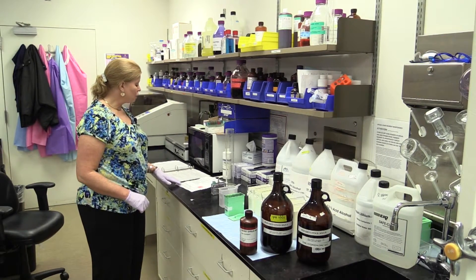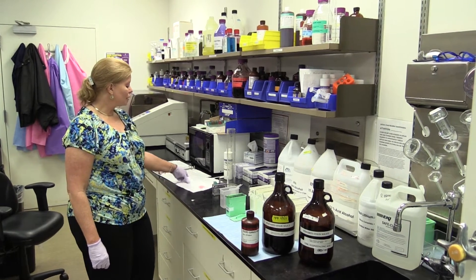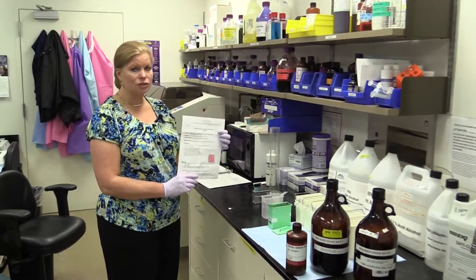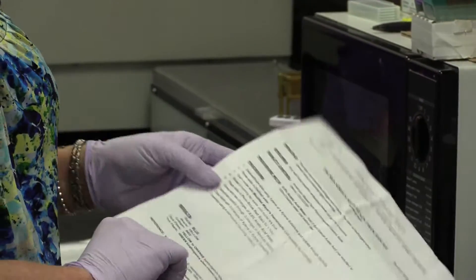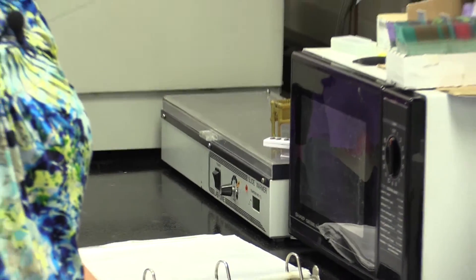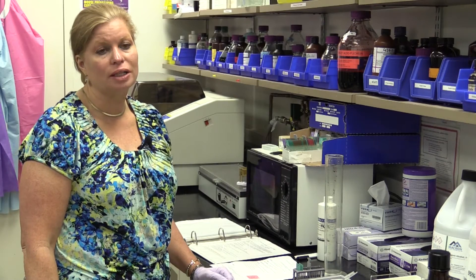The protocol I'm going to use is from John Kiernan's histology book, but we also have a protocol from American Master Tech, and either one is fine. I prefer John Kiernan's because he goes into a nice, in-depth explanation of the different types of collagen, what they stain for, and the type 4 collagen that doesn't stain — and the kidney example explains that further.